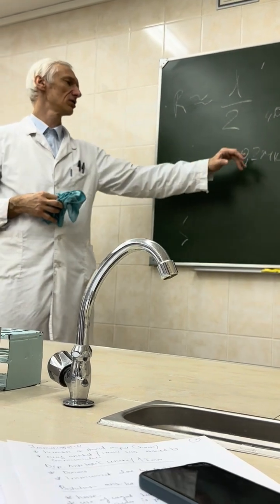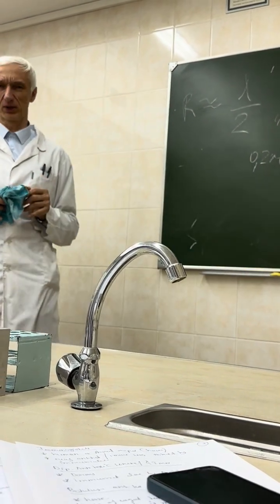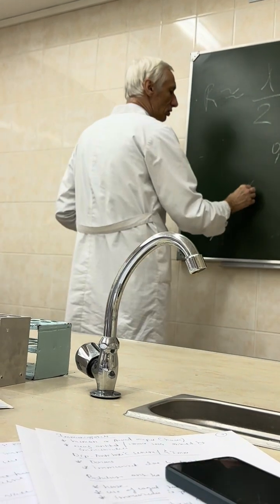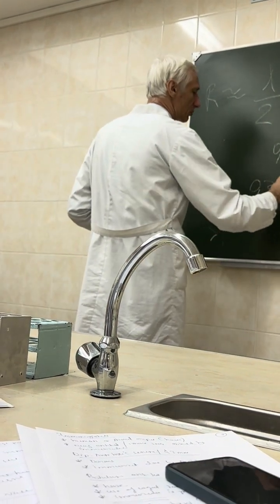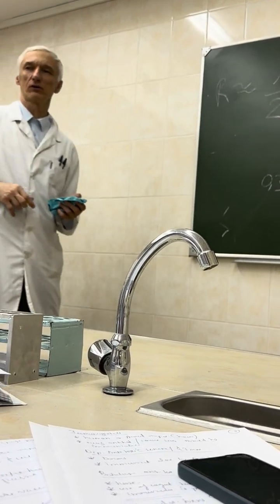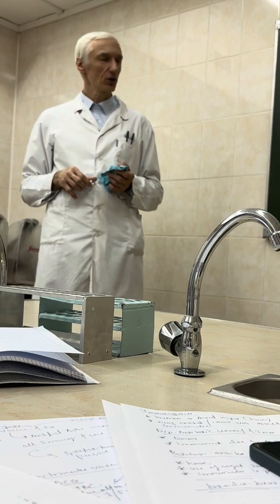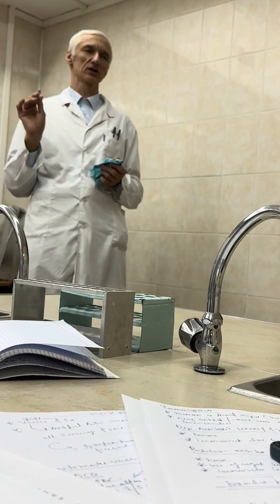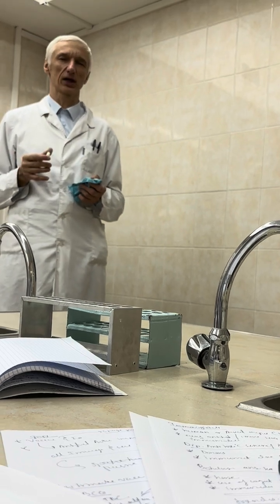Going lower, like 0.05, is almost unachievable. So that's why, people, standard microbes like cocci are 0.3, 0.5, 1 micrometers, and we are operating at the limit of the resolving power of a light microscope. Okay, if so, people, we must extract all the information that is possible from bright field microscopy.